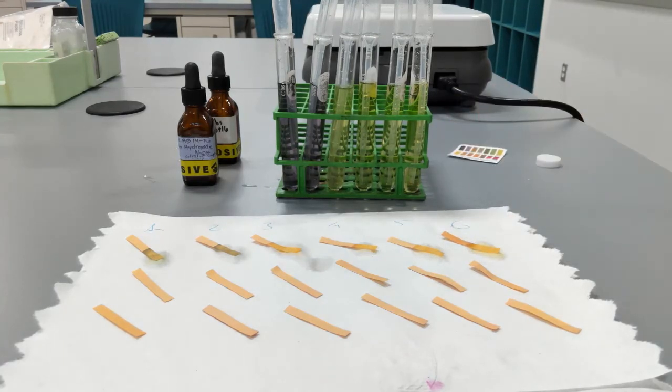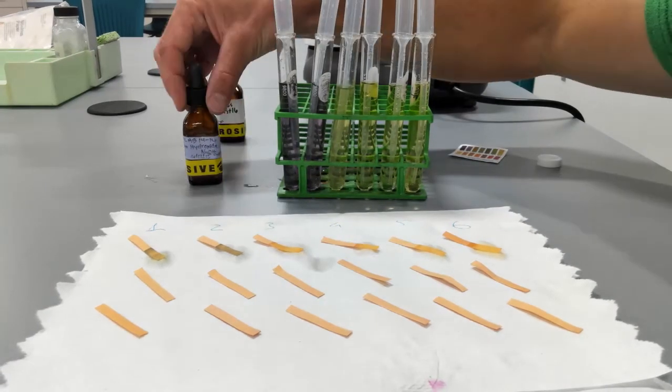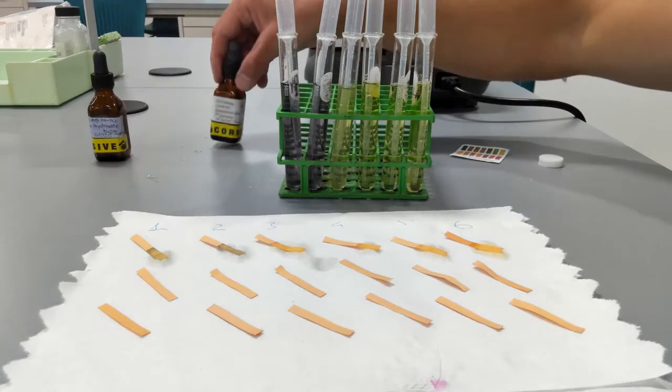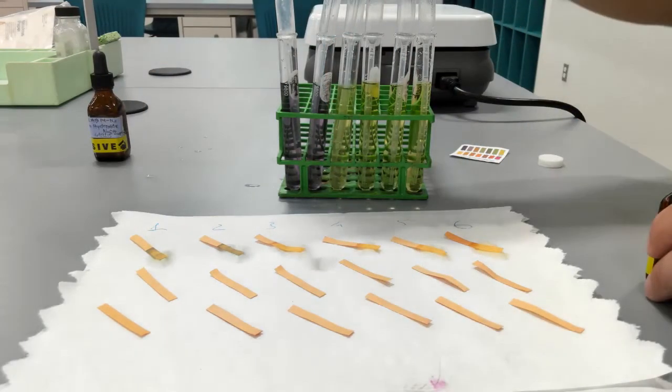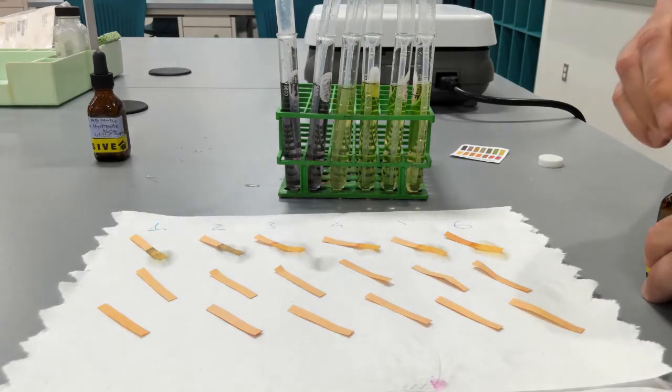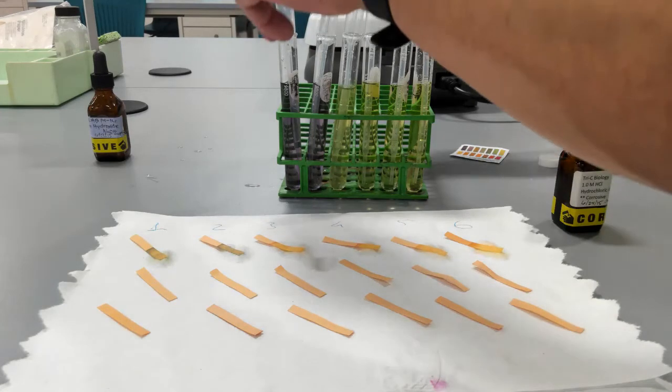Now I'm going to add 1 drop of hydrochloric acid to the tubes 1, 3, and 5.